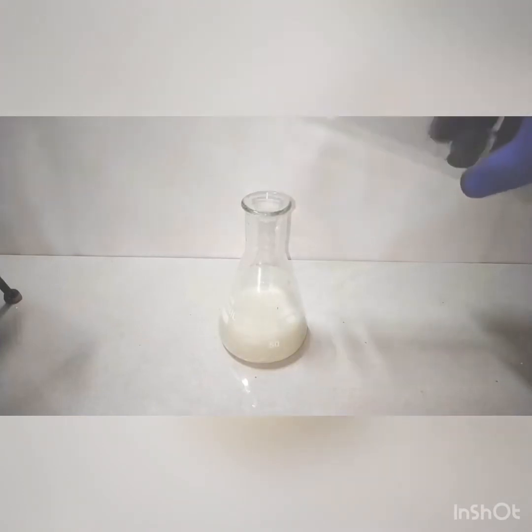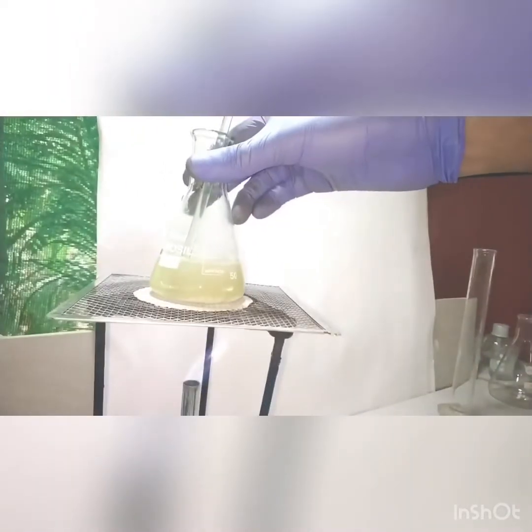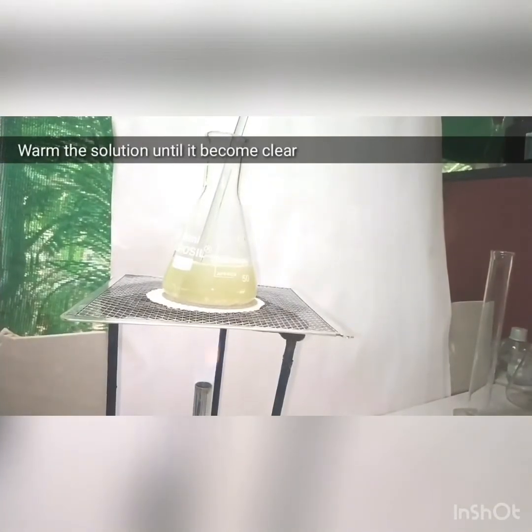Sulfanilic acid, being an acid, starts a reaction with the carbonate, giving out carbon dioxide, which you can see as the effervescence. It forms the sodium salt of para-amino benzene sulfonic acid.